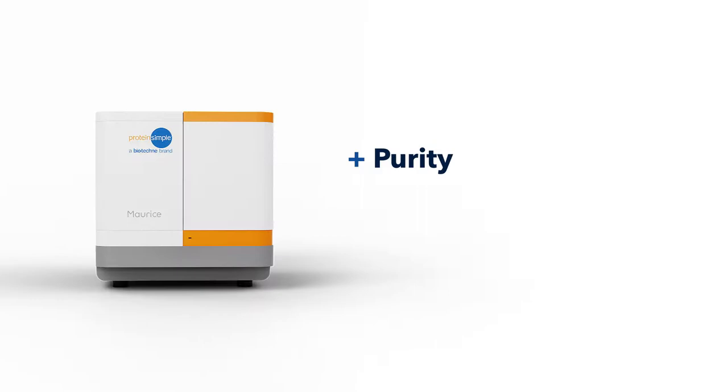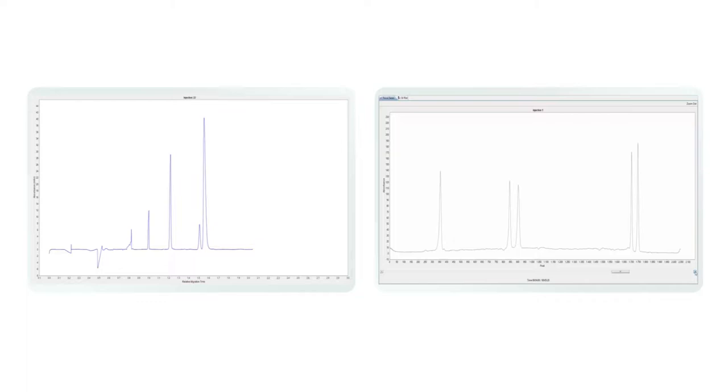Get purity, size, and charge heterogeneity data on your biologics. You've got a lot of samples to run and a lot of molecules to analyze. Maurice lets you develop platform methods in less than a day so you can get the results you need in no time.